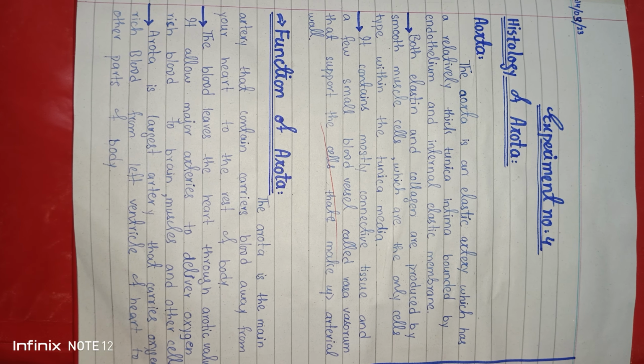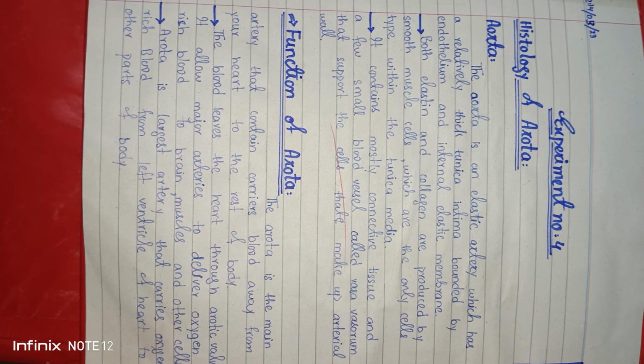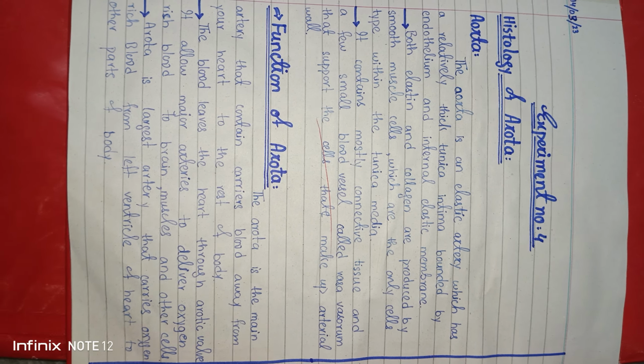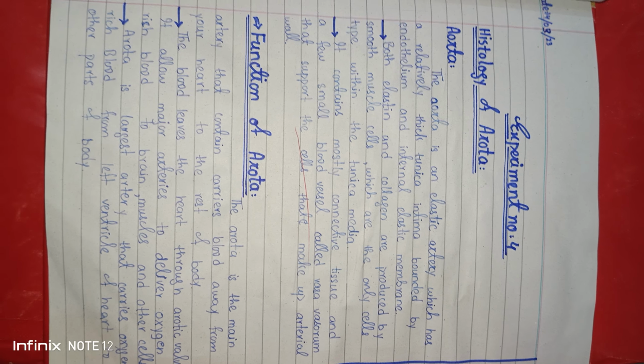In today's video we are going to discuss another important practical of anatomy, and this practical is about histology of aorta. So aorta ke bare mein aap sab log jante hain ki aorta ek artery hai jo heart se bahar nikalti hai aur puri body ke andar blood ko distribute karne ka function hai iska.